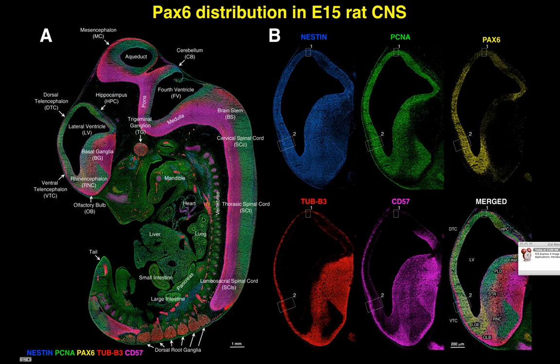large numbers of cells. And we can actually see on the right, in panel B, that nestin, even though it's all over the telencephalon, we're looking at the insert of a telencephalic region, you can see most of the cells are proliferating. However, most of those are actually dividing by asymmetrical divisions, judging by the PAX6 expression.